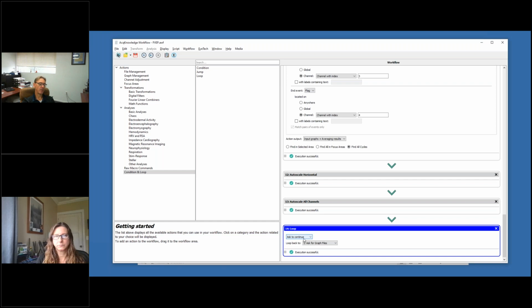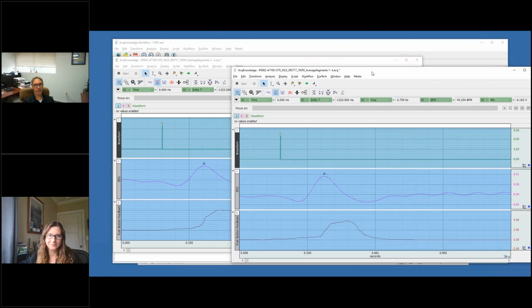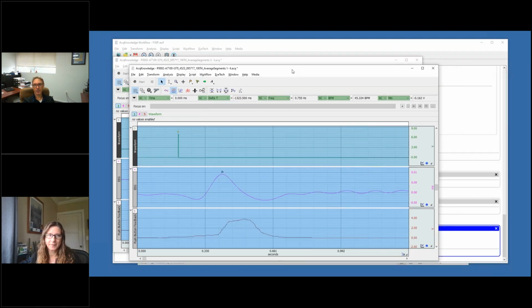There is no upper limit, but if I load this particular workflow with 50 files, it just kind of bogs down. It will do it, it just takes a long time. So my preference is to do it in smaller chunks. It's a long-winded way of saying there is really no upper limitation, but there are practical limitations.